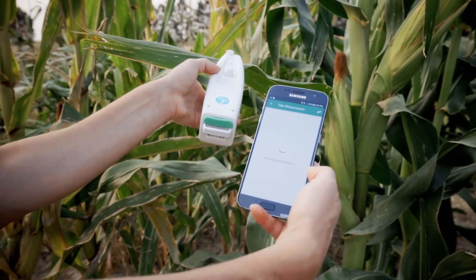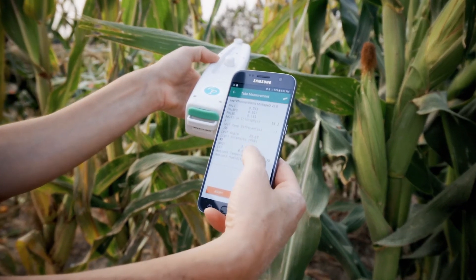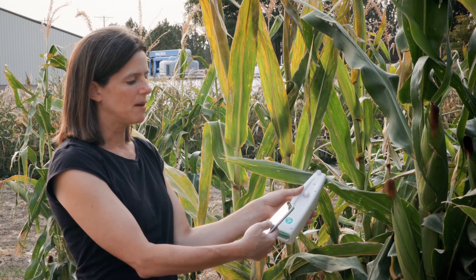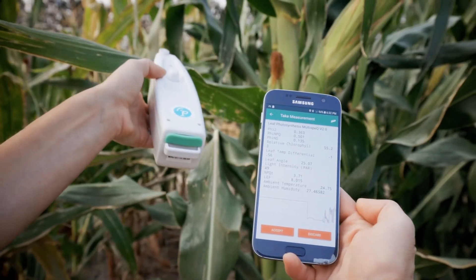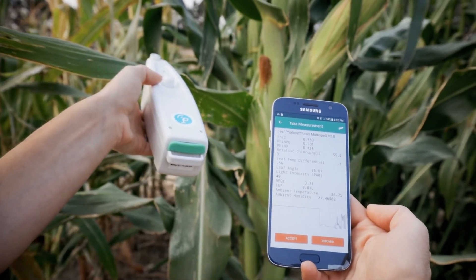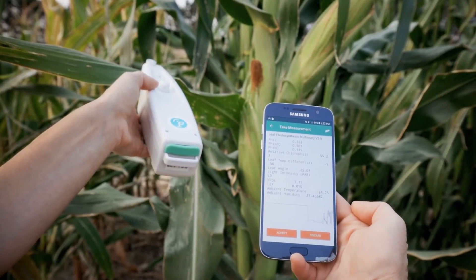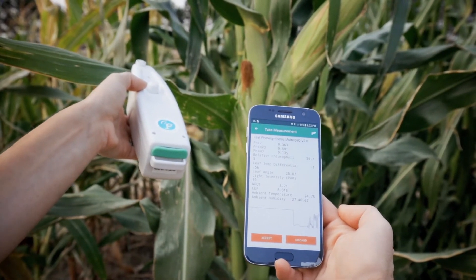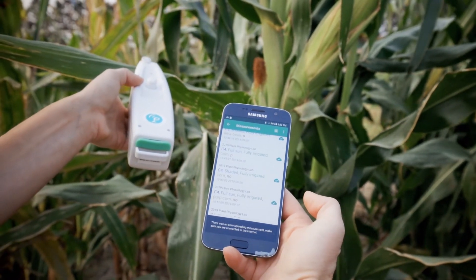It takes about 15 seconds to run through its measurements and then it will pop up with some data on the screen. Once we get back into the lab, we can upload it once we're on a network. Right here it shows the actual data: ambient temperature, humidity, chlorophyll content, our PAR level — which is photosynthetically active radiation — as well as the stability of those measurements. I can accept that, and then it will be uploaded to the web and we will share this data with you.